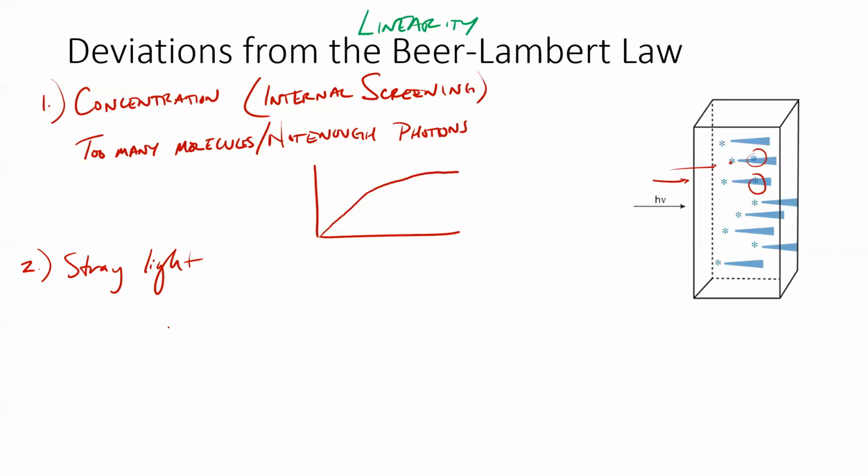If we forget to close that instrument top or something, then there's extra room light getting into our sample that didn't get into the background, the zero. Yes, this is a human error rather than an instrument error usually, and so correctable, but still it's something that we should be able to notice, right?